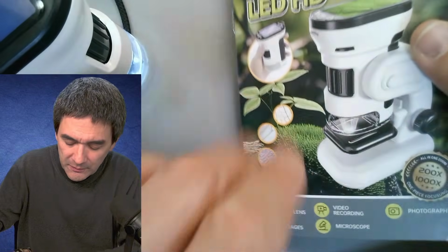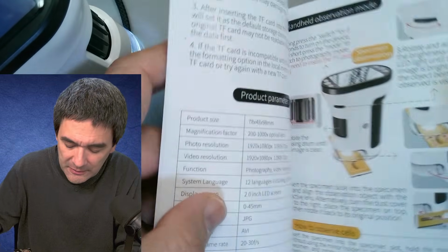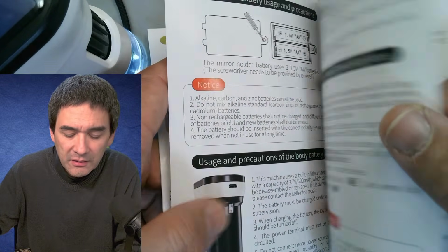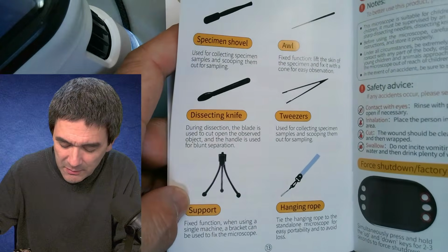So there's a manual over here. It's quite well documented, actually surprisingly well documented. It contains, and even some basic specimen prep. It came with a couple of accessories as well.